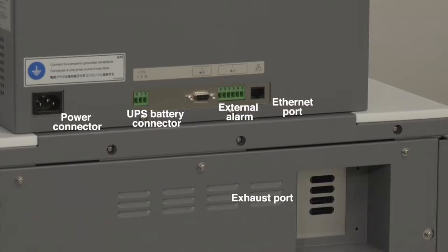In the back of the unit you will find the power cord which is not hardwired and can be removed, the connection port for a UPS backup battery, connections for attaching an external alarm, an Ethernet port, and the external exhaust port for the air system.